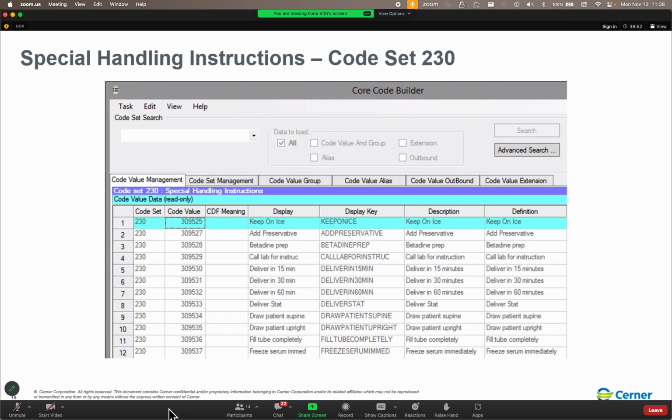So here's troubleshooting Oracle Health specimen management. You've got configure specimen management collections. So yes, there are reference pages. There are actually reference pages. If you look in the notes under the slides, a lot of the reference pages will be specifically called out.